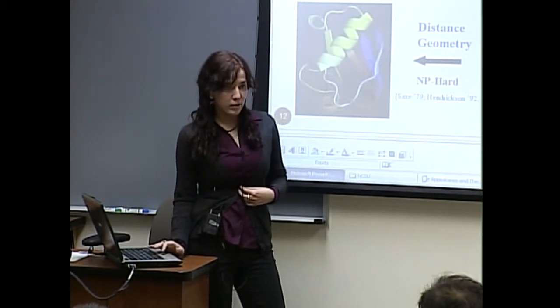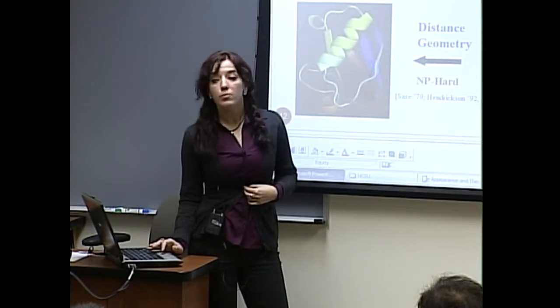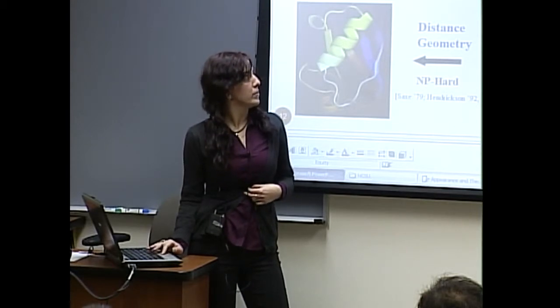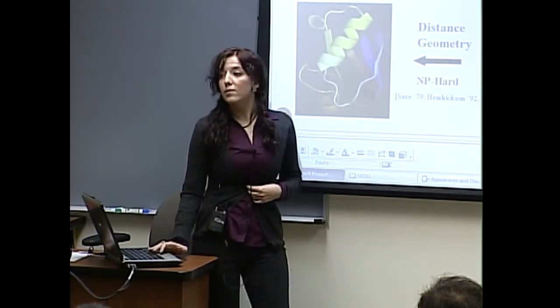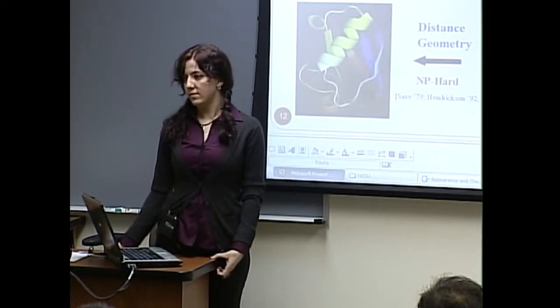Obtaining even the complete table, which would require n-squared entries in it, is impossible experimentally. And even if it's possible, then it always contains ambiguity. So there are many problems. And yes, that table contains all of the distances between the different components.